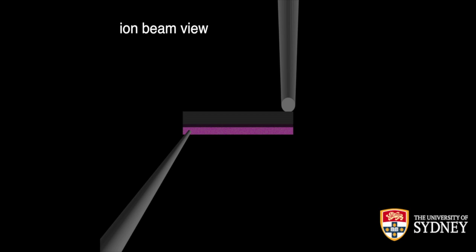So all you need to do in this case is, while your support structure is sitting flat, so the pins are parallel to your electron beam axis, you just cut off the top bit so that the top is about 1 micron to 1.5 microns in diameter. Of course, if you use the posts that are already 2 microns across, it's unfortunately a little bit on the large side. What this does is, well, first it gives you a fresh surface which doesn't have any contamination on it, apart from the obvious gallium contamination.